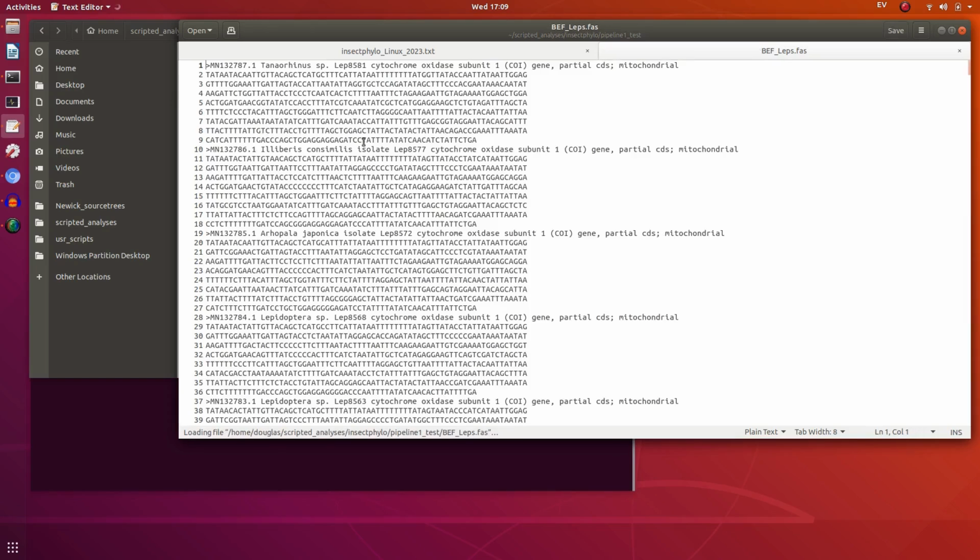Open the text editor. You can see typical NCBI format. These are called description lines for NCBI in each FASTA entry, rather complex: accession, species names if present. We've added some code. This can be used particularly in this data set, also the marker name. Now note, some of them have species names, some of them do not.